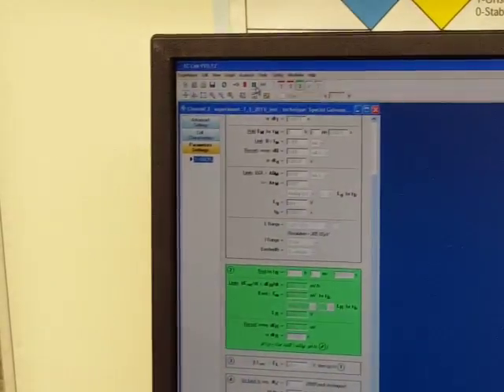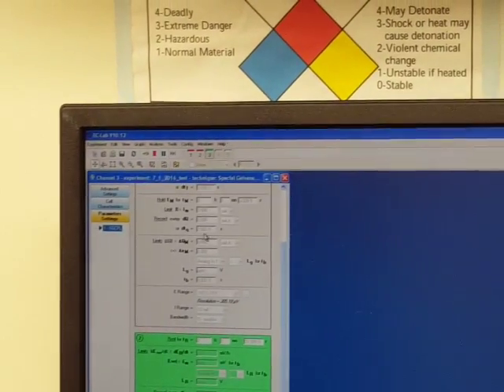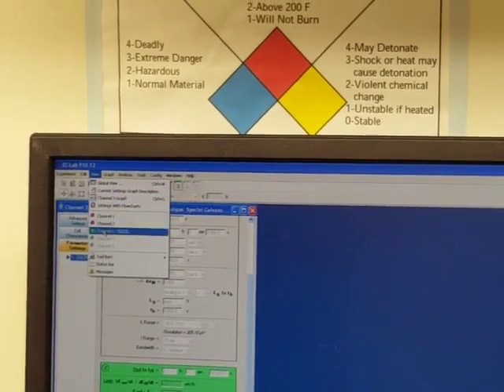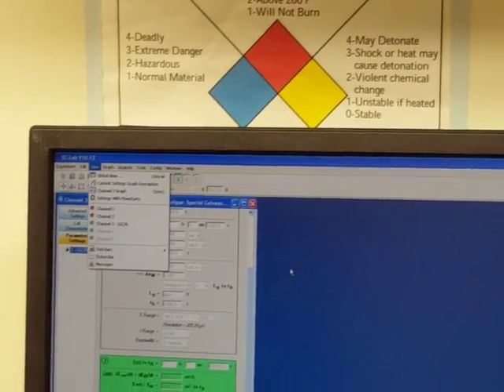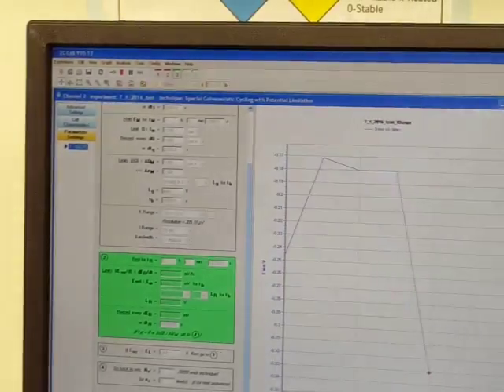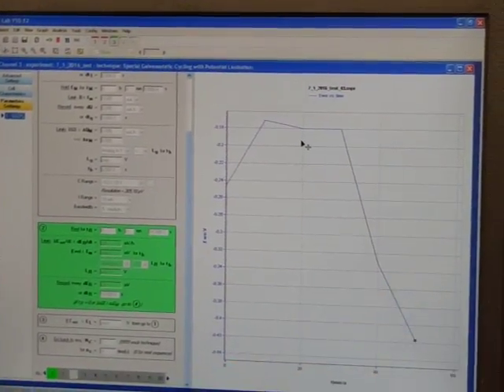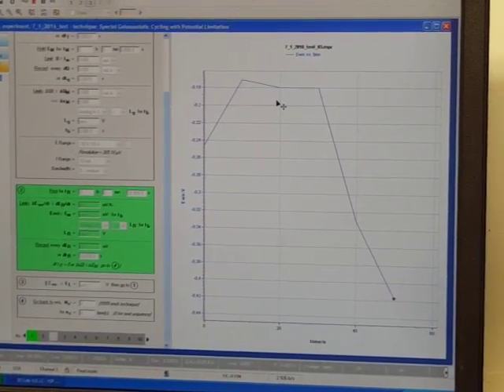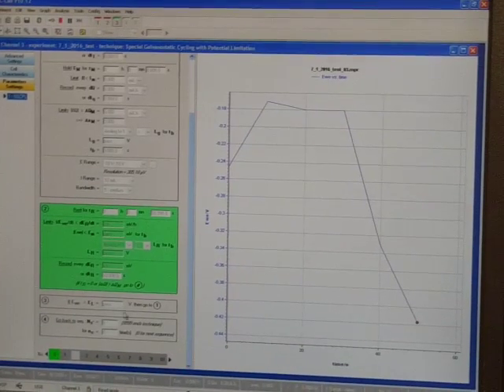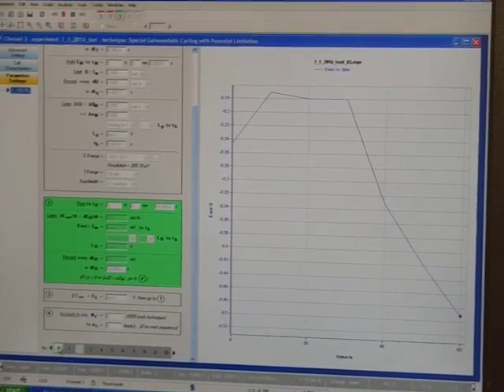So when I push, oh, we started the experiment. I started the experiment. Oh, let's see, where's the graph? View. Oh no, here it is. Wait, is this it? Yeah, there it is. Okay. So it's measuring right now the difference in voltage potential between these two, and there's nothing connected, so there's nothing meaningful. The green shows you which sequence it's on currently.